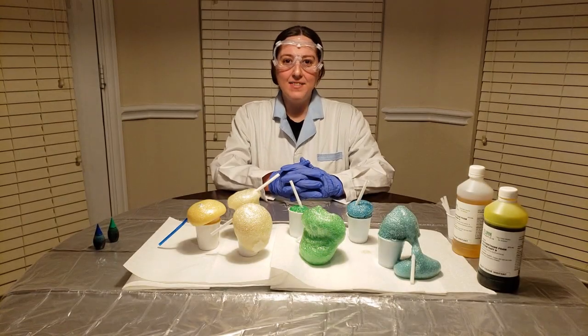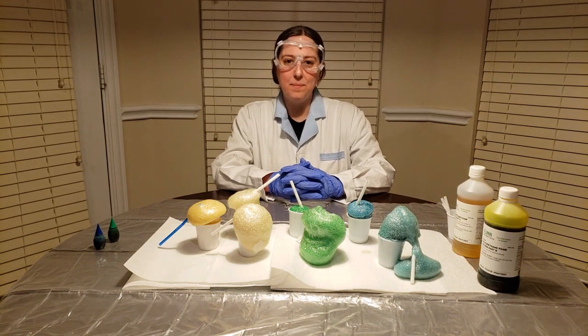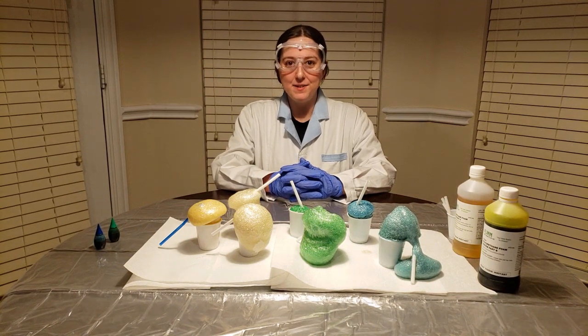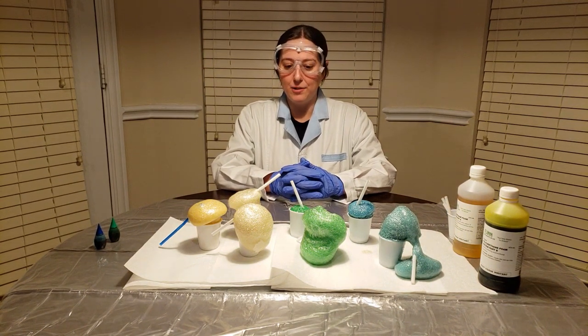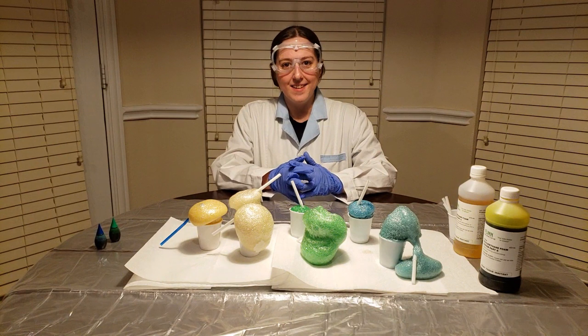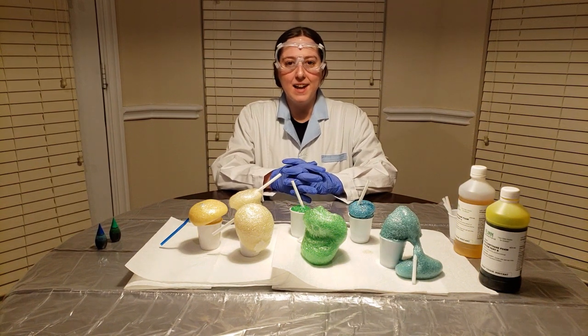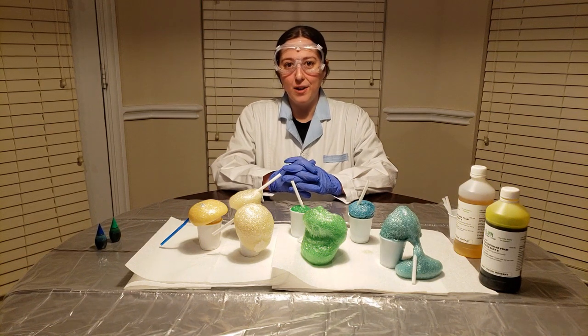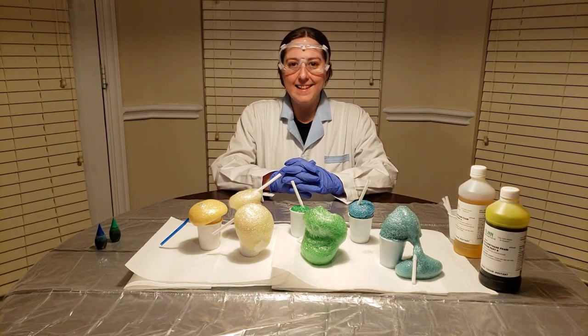I'm glad that you joined us for our video today, and I hope you enjoyed watching the chemical changes in our foam lab. If you got to participate and do a foam lab, I hope you had some great results. You can see various results here as well. I hope you had a good time and have some awesome foam. Remember, do not touch it until it's fully hardened. Make sure you're safe, and keep loving science. Bye guys!